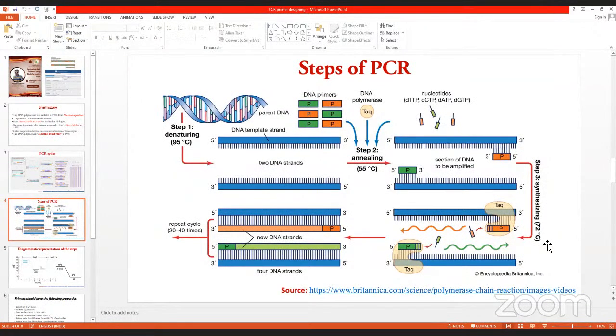That's why people have devised different tools. If you Google it, you will find lots of PCR primer design tools, online tools, and offline tools are also there. There are many programs and software, or you can make your own also. No problem. But from my point of view and experience, I can tell you, Primer-BLAST of NCBI is the best platform for making PCR primers. Why? That I am going to discuss now.